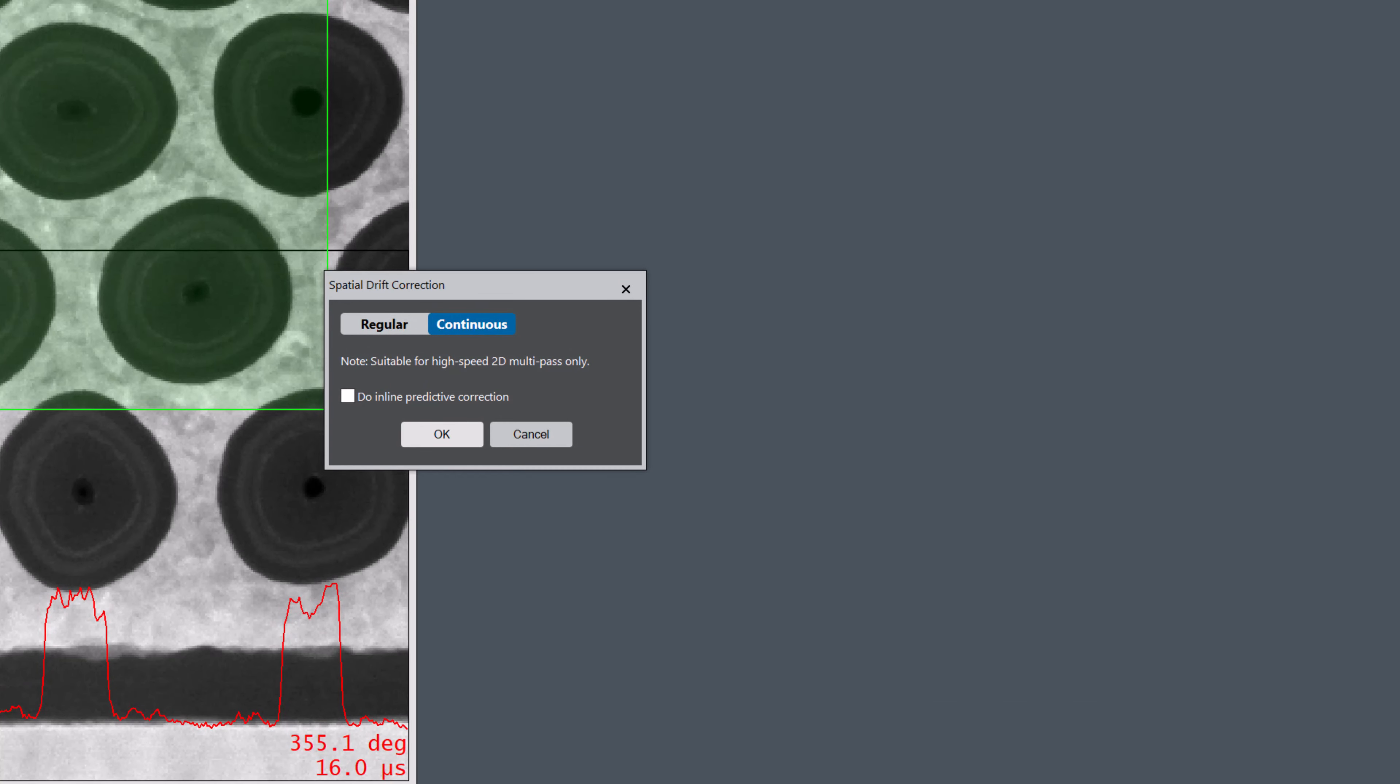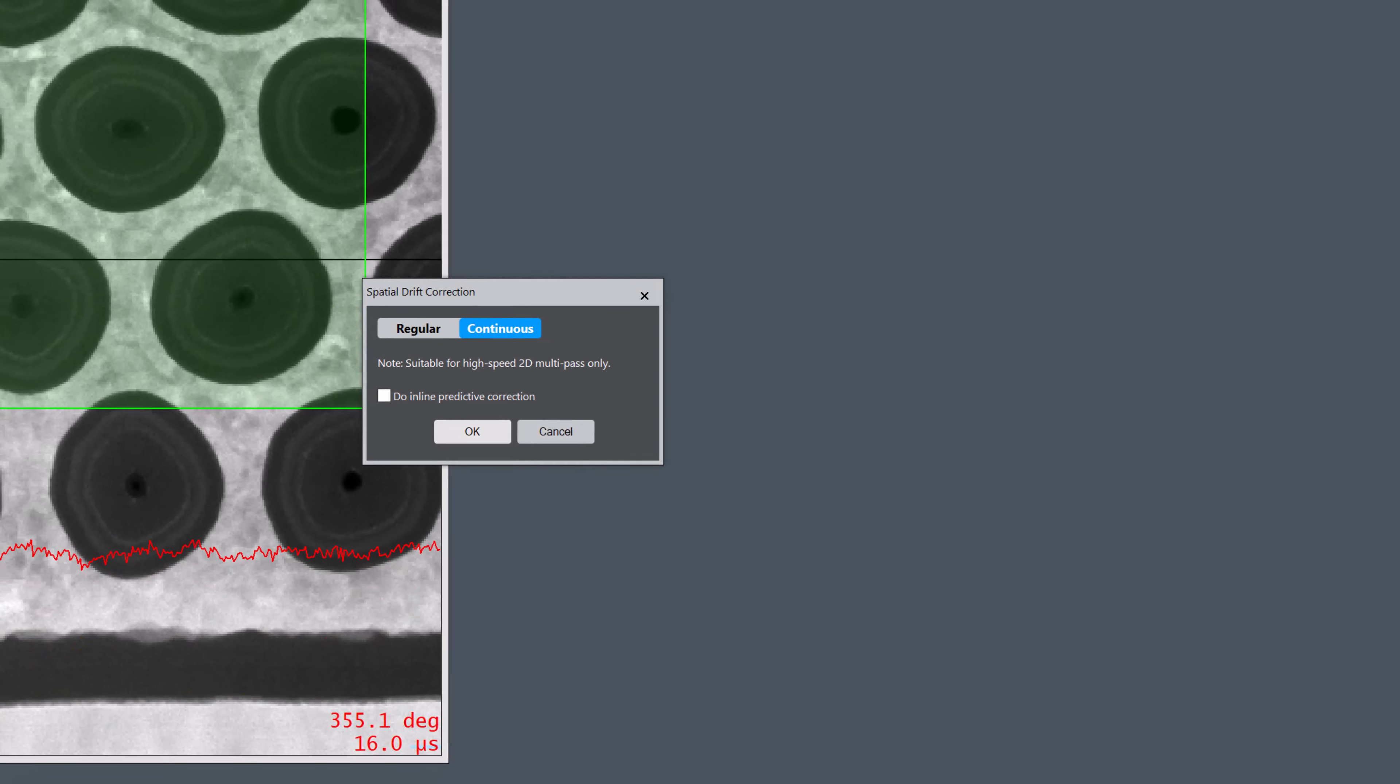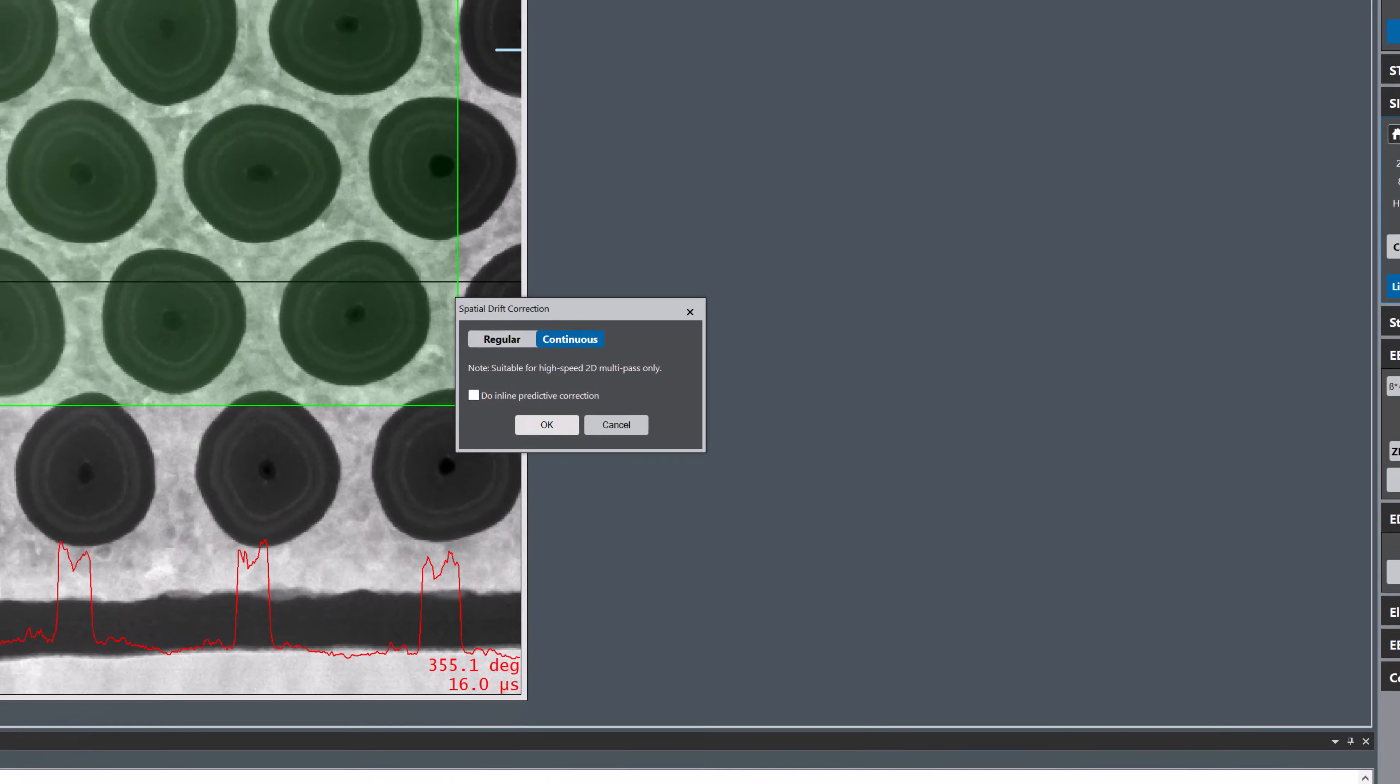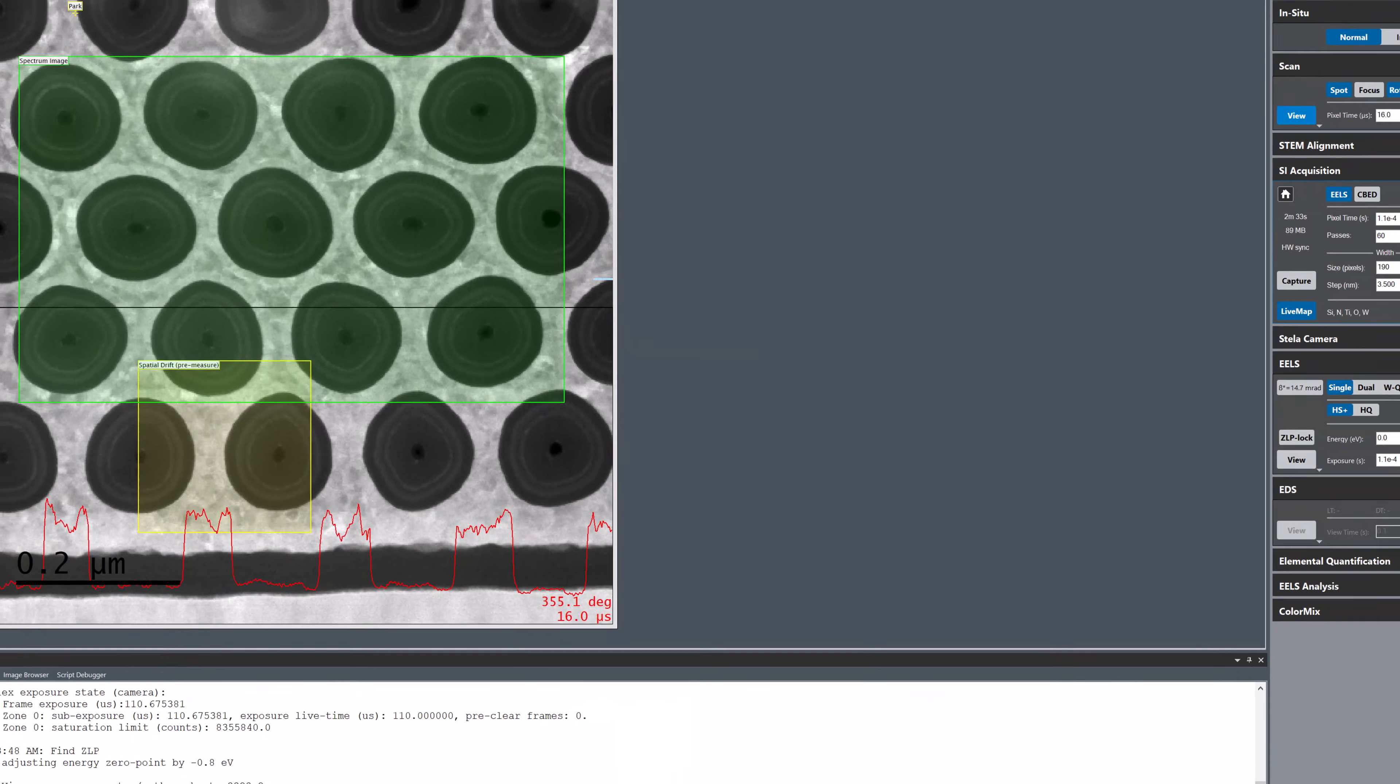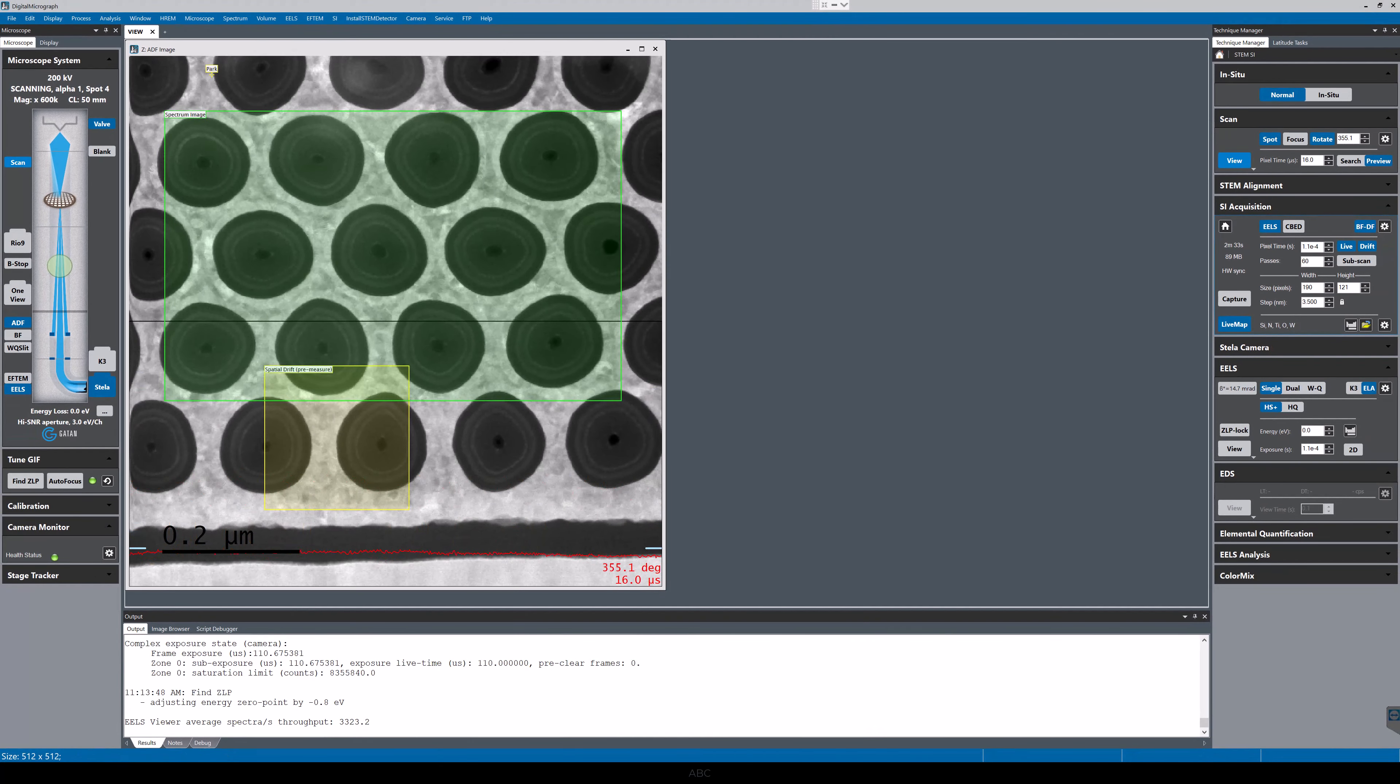I'm happy with the Drift Correction region, so I just click the Capture button in the Spectrum Imaging palette to start the experiment.